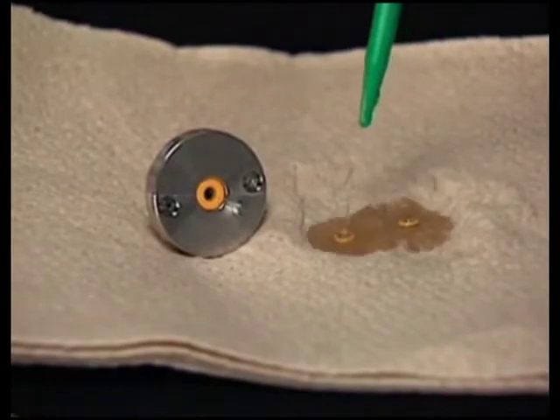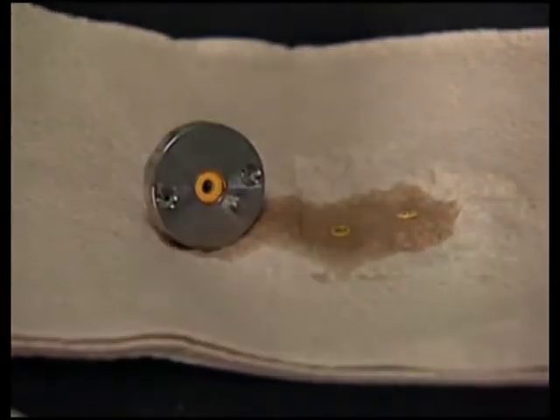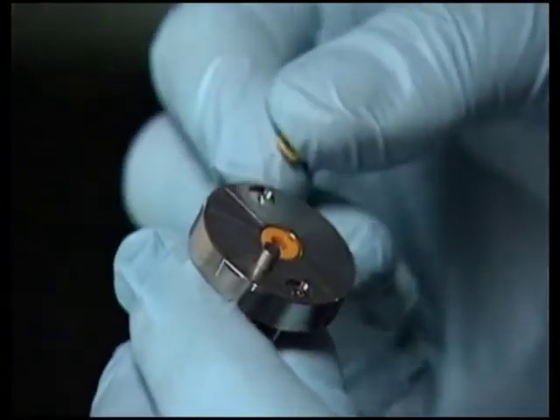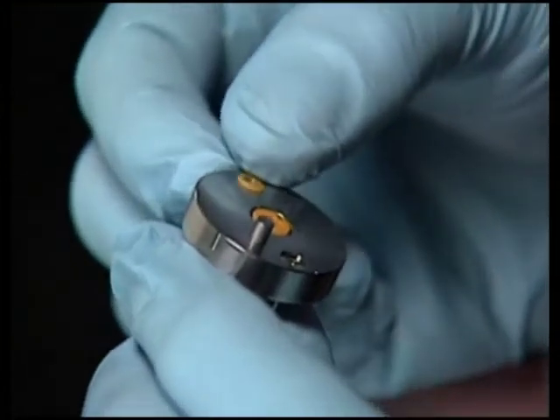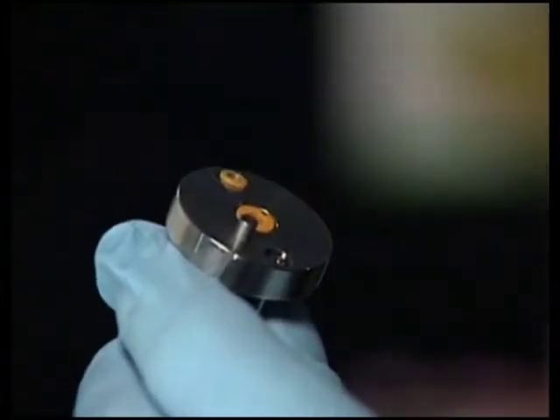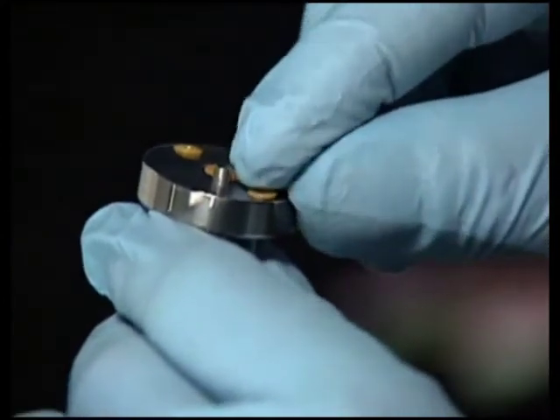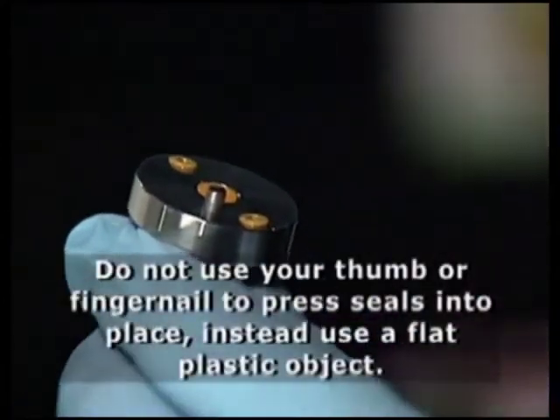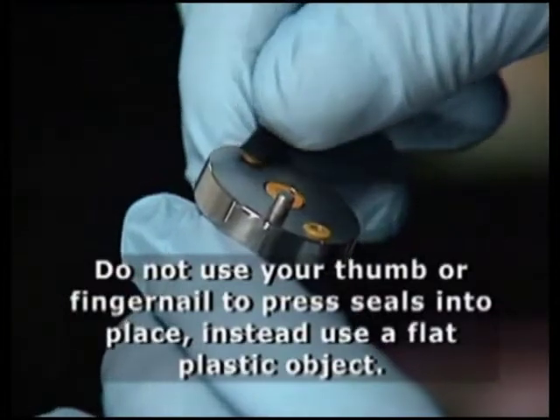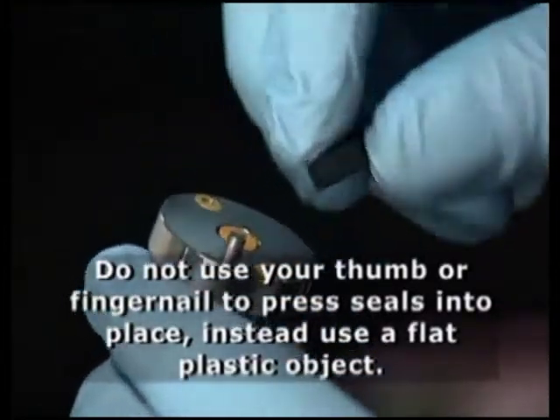Wet the new face seals and the openings in the head thoroughly with methanol. Place the face seals into the openings on the head and press them into place using a flat object that covers the whole area of the seal. Do not use your thumb or fingernail to press the seals into place as they may not sit flush in the head.